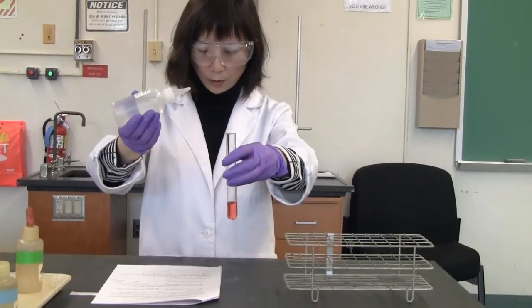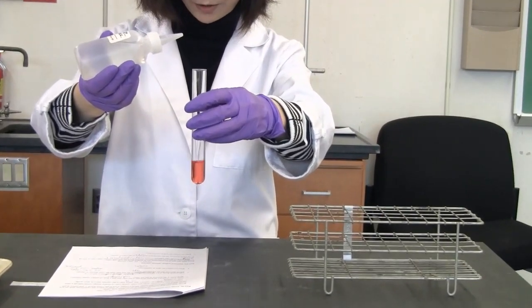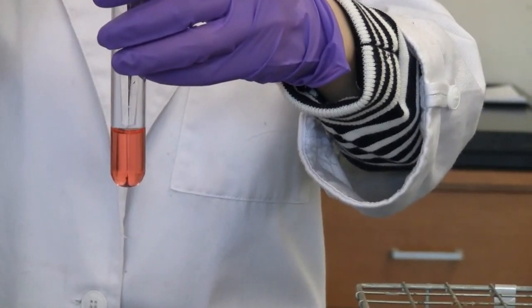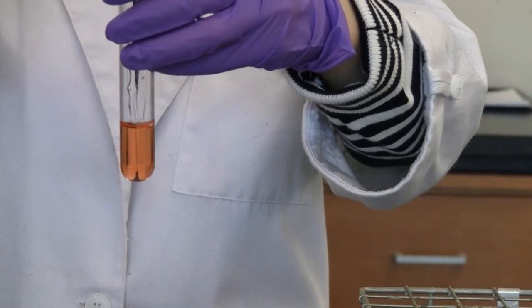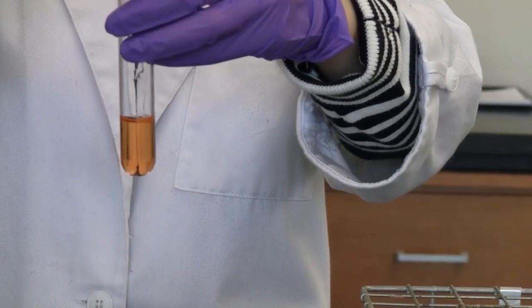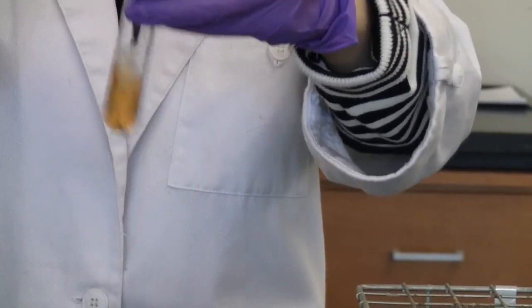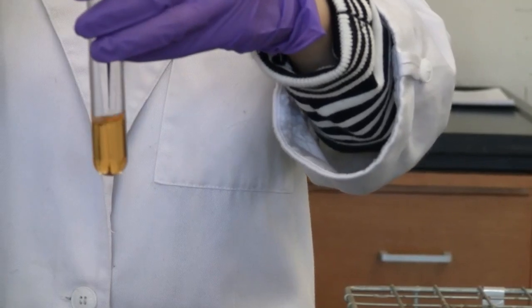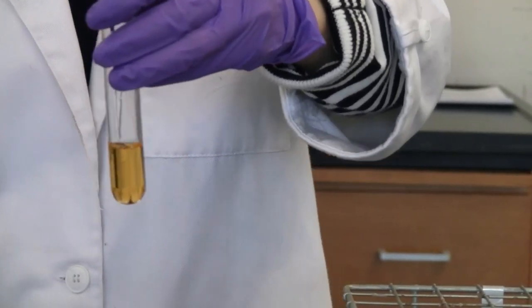So you are going to observe the color change and decide which direction the equilibrium shifted. It's gradually changing color. You already see the color change. Maybe a little more, just to make the color change more obvious.